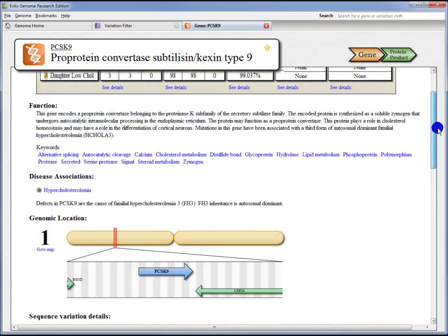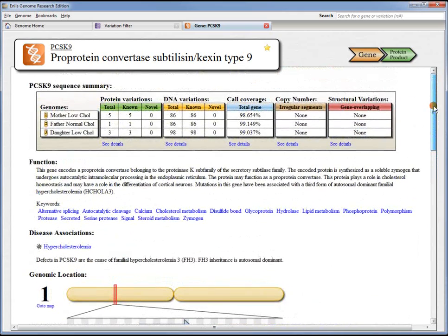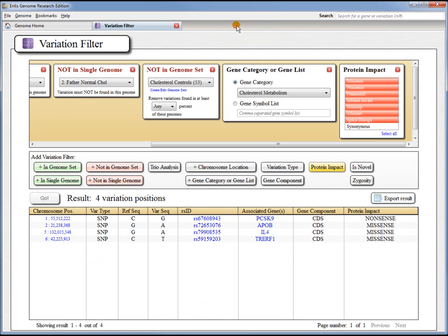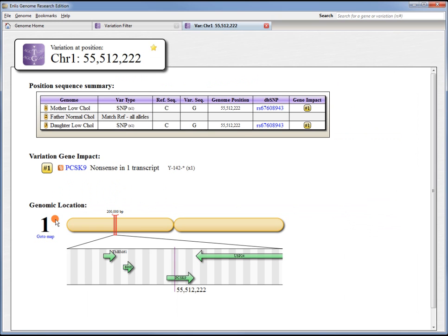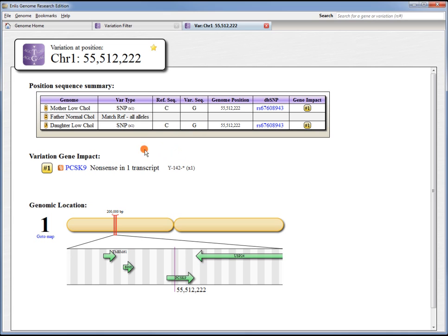We've read all this information, we think this might be a good candidate, so let's go back to the variation filter page. We might want to open up a position page and verify that the variation we found is the type of variation we were looking for. We were looking for a variation that was present in the mother and daughter, and indeed we see that they share a SNP at this location. They're heterozygous for a C to G change. The father shows matching reference on all alleles, and that indicates that we successfully sequenced the father at this position and he matches reference.